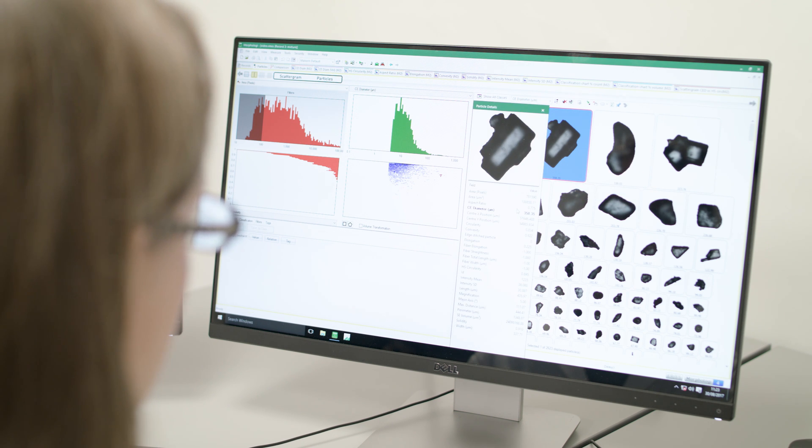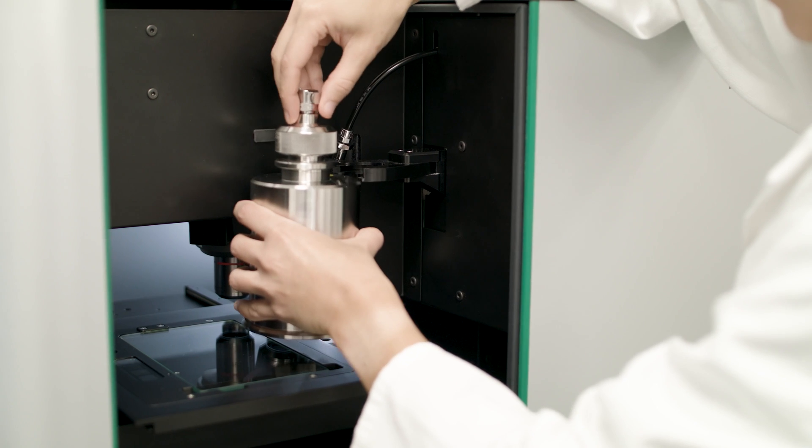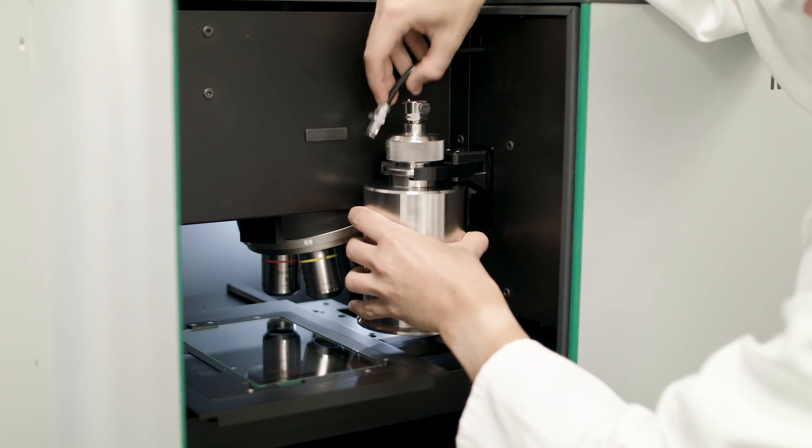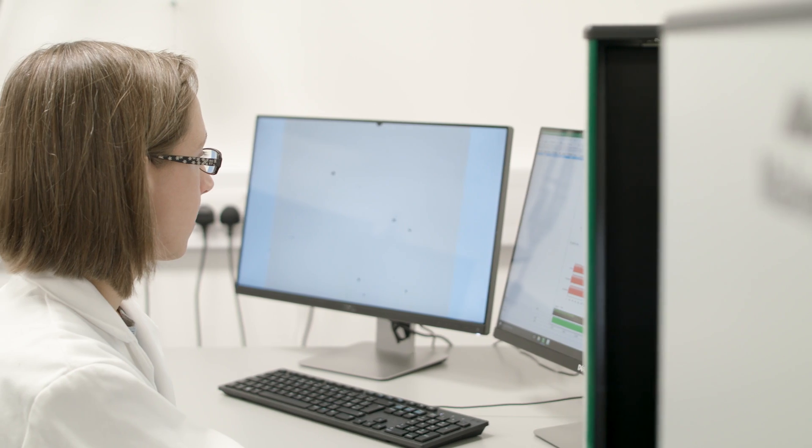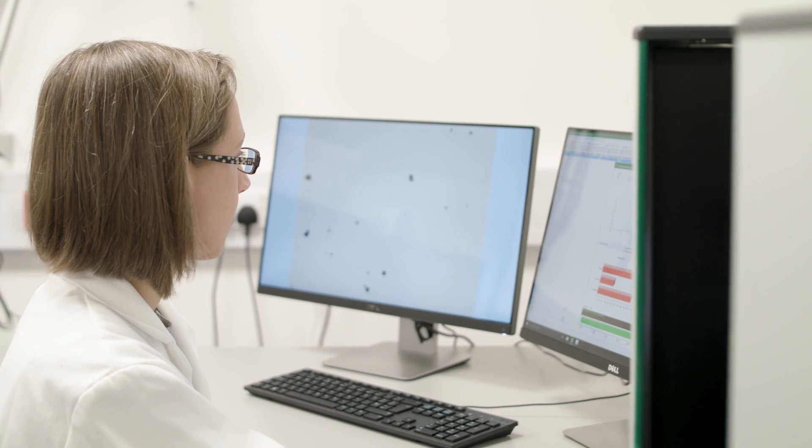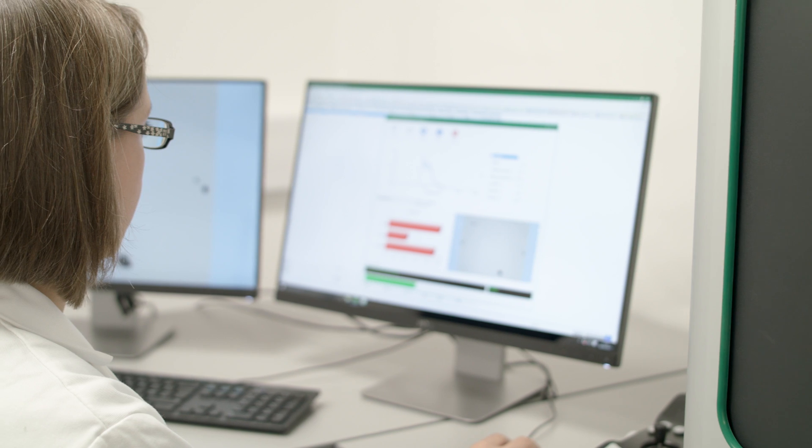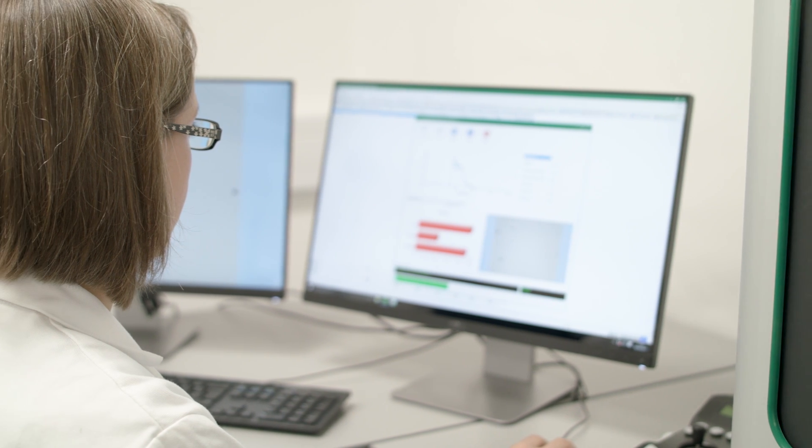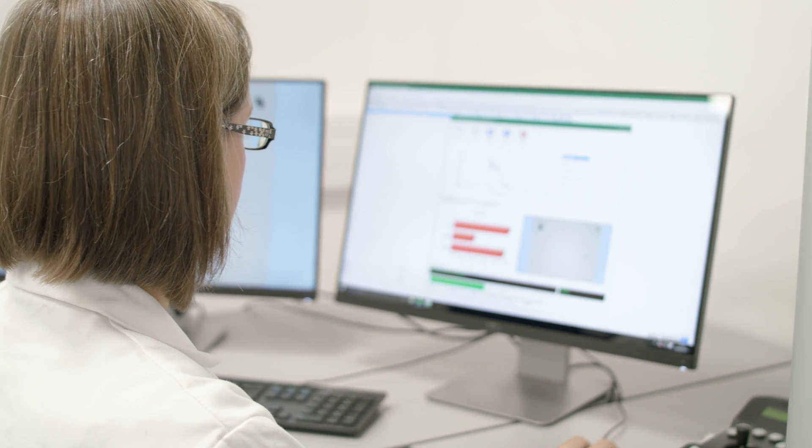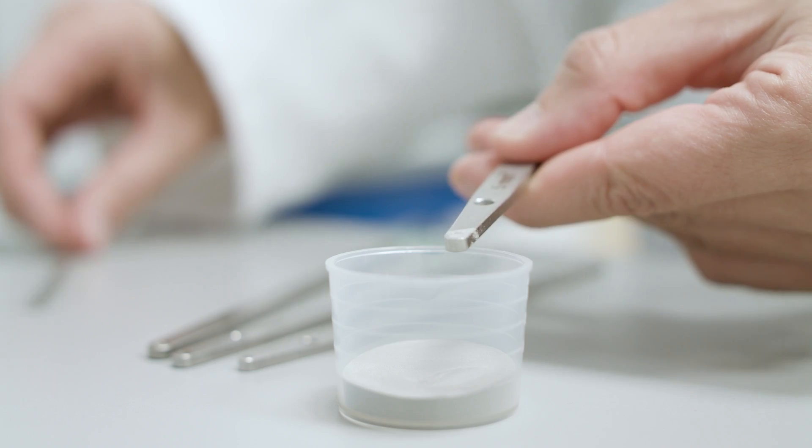The instrument is simple to use and the intuitive software features, such as SharpEdge, simplify the process of developing fully automated standard operating procedures.